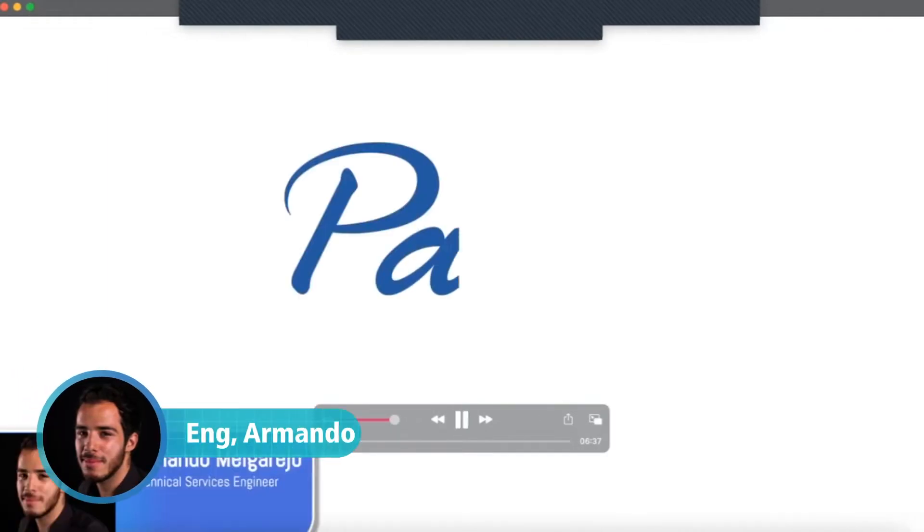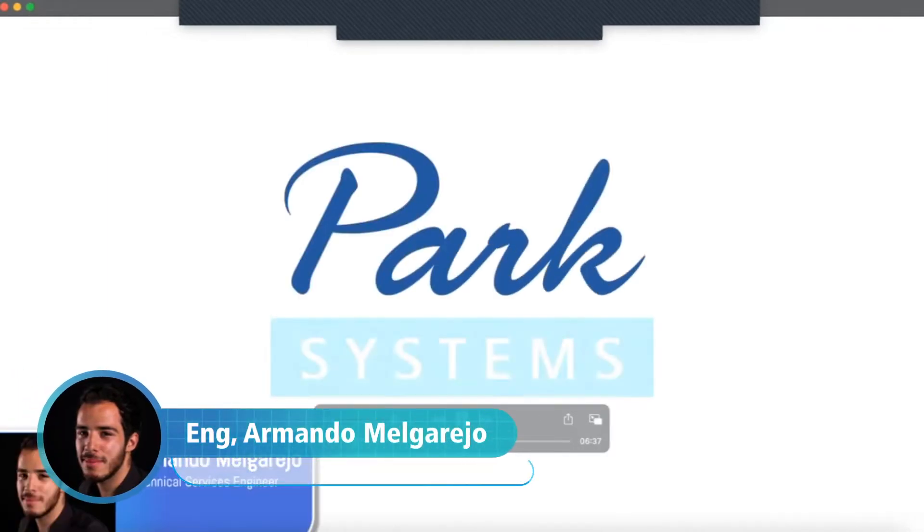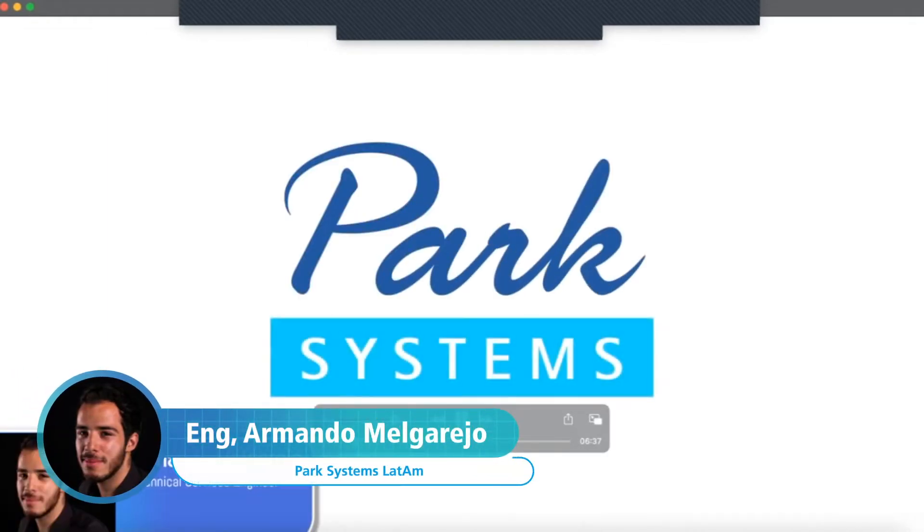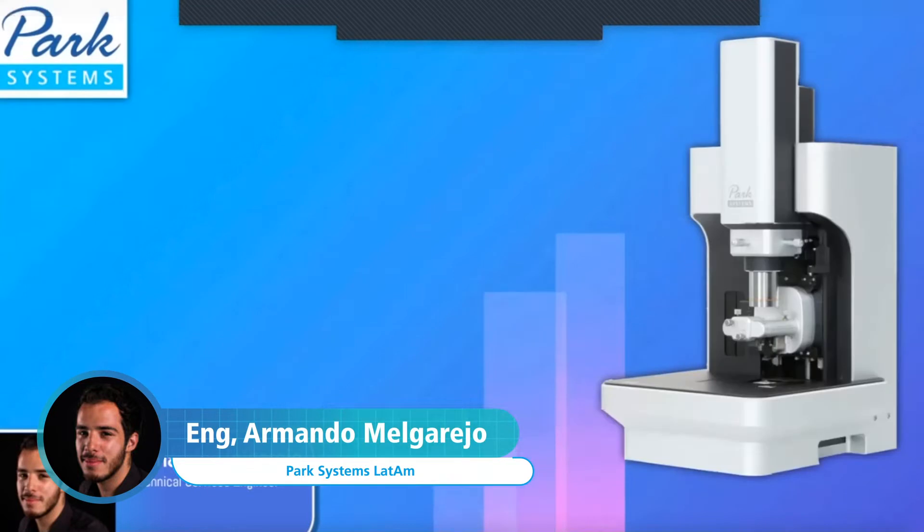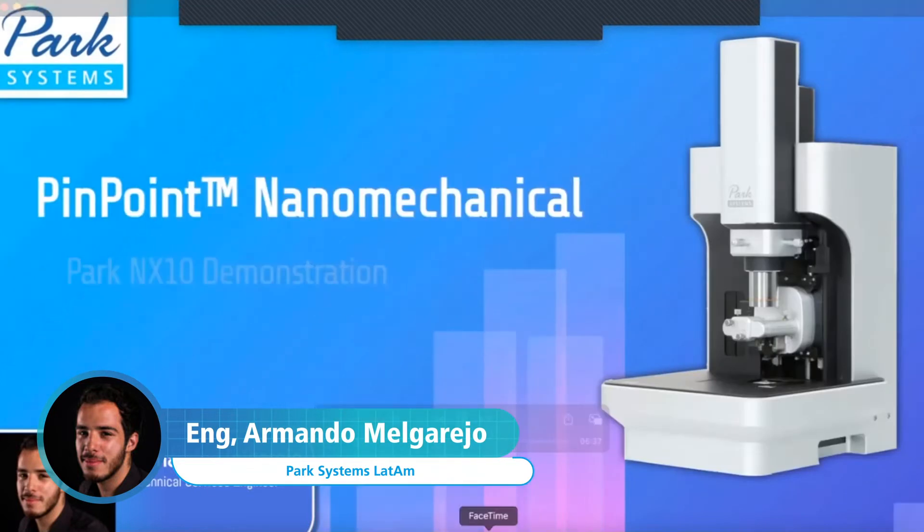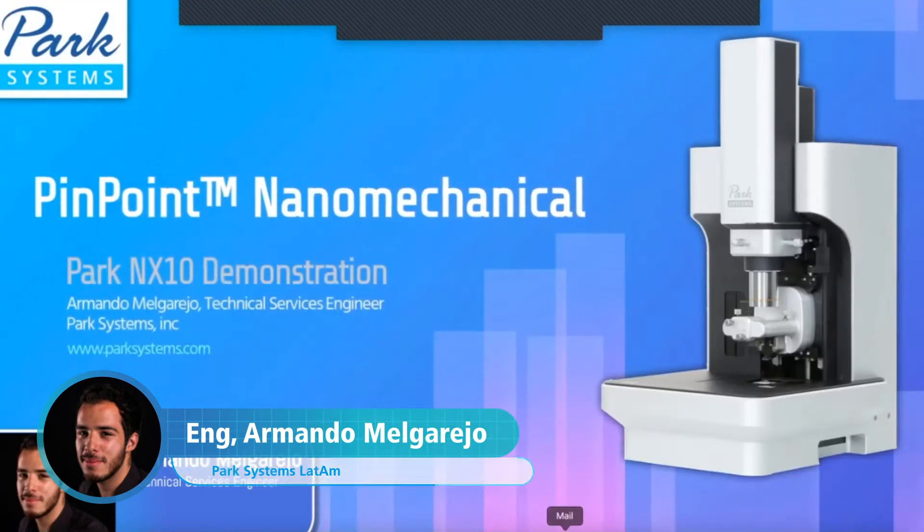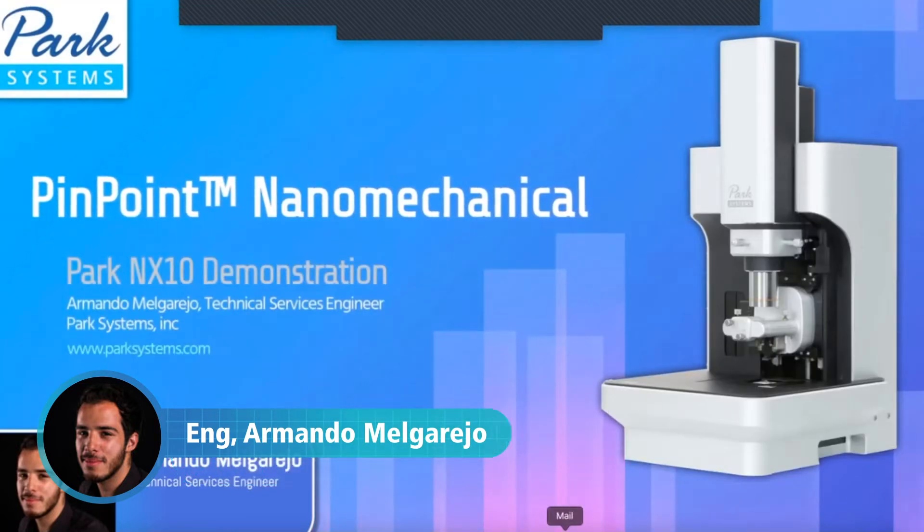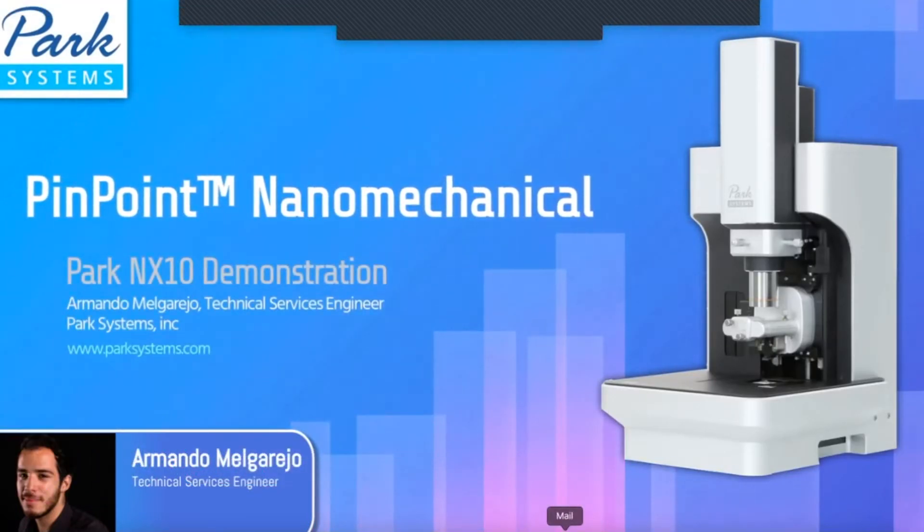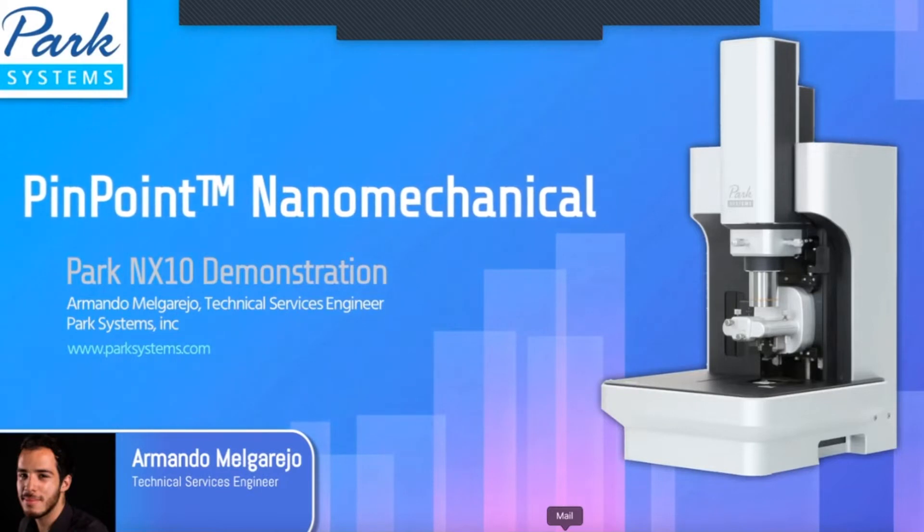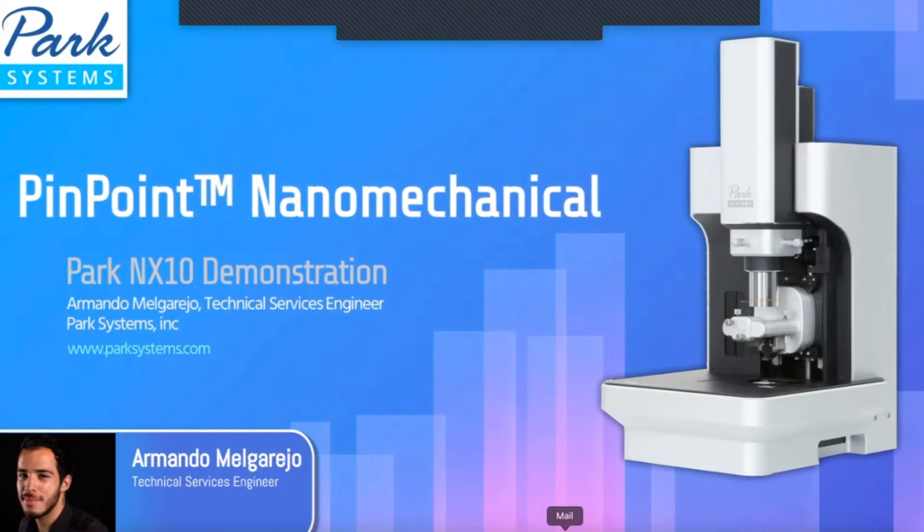Hi everyone, my name is Armando Melgarejo, and I'm a technical service engineer at Park Systems. During this session, I'll demonstrate how to acquire a two-dimensional mechanical property of a material on the nanoscale.